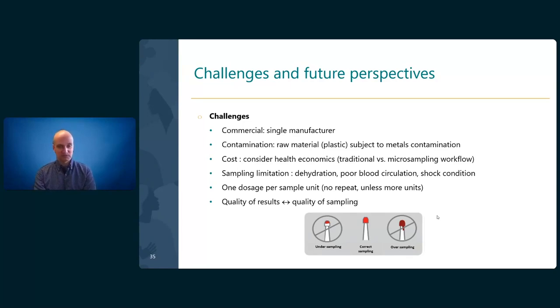However, we have to consider the full workflow, the full process, when assessing the cost and comparing with the traditional way. We have to consider collection, storing, transport, handling, and waste management as well. So for that reason, it's not easy to conclude that VAMS devices are just more expensive than regular collection tubes.